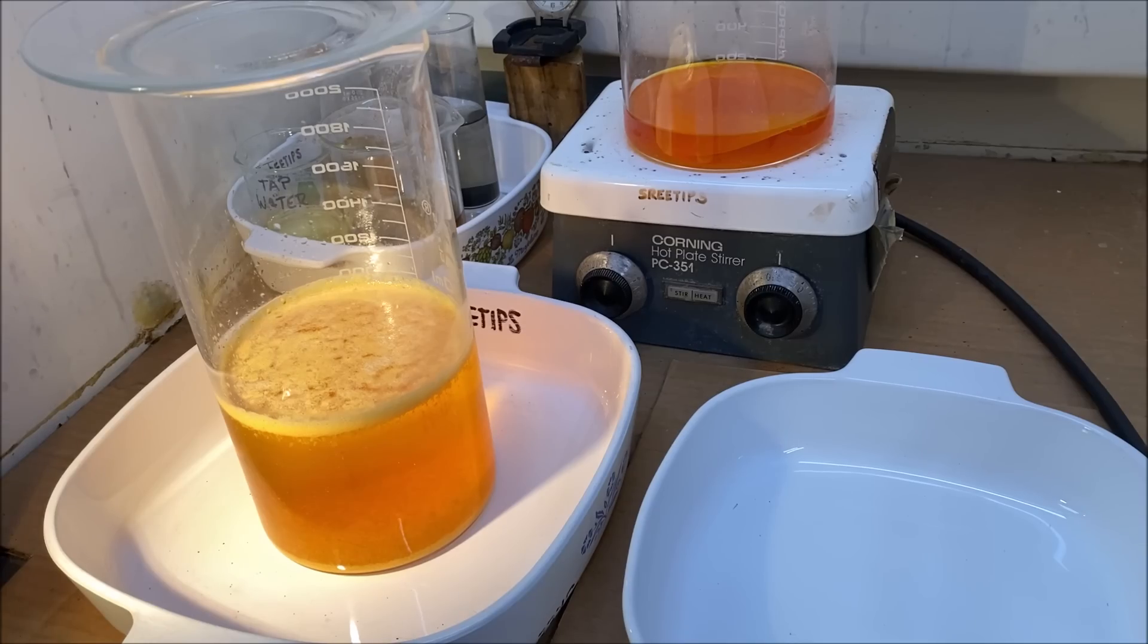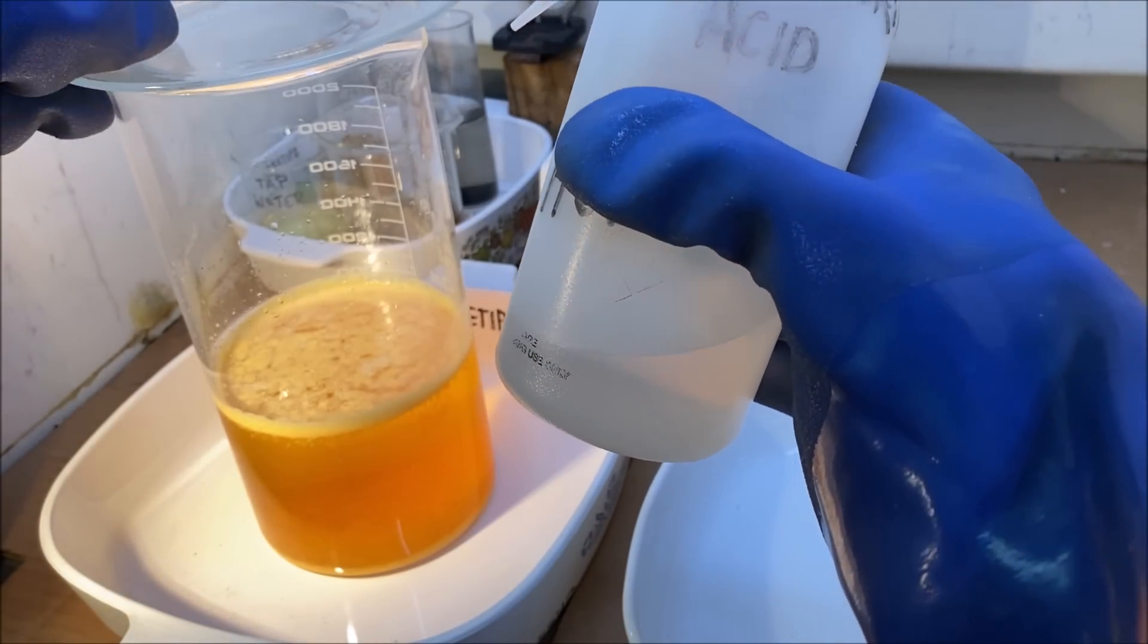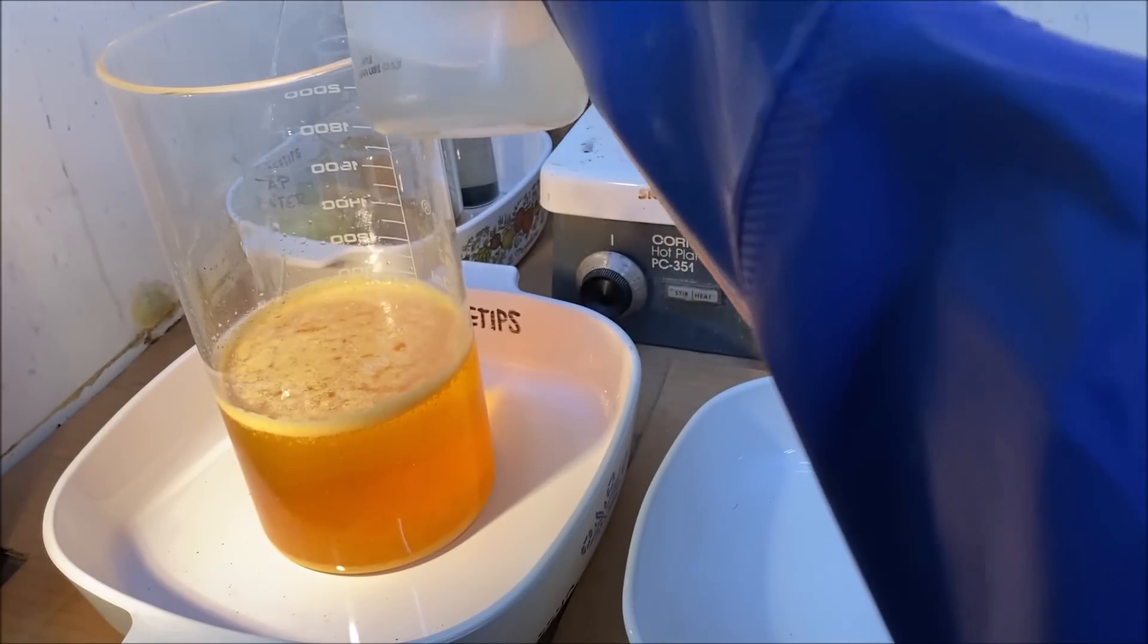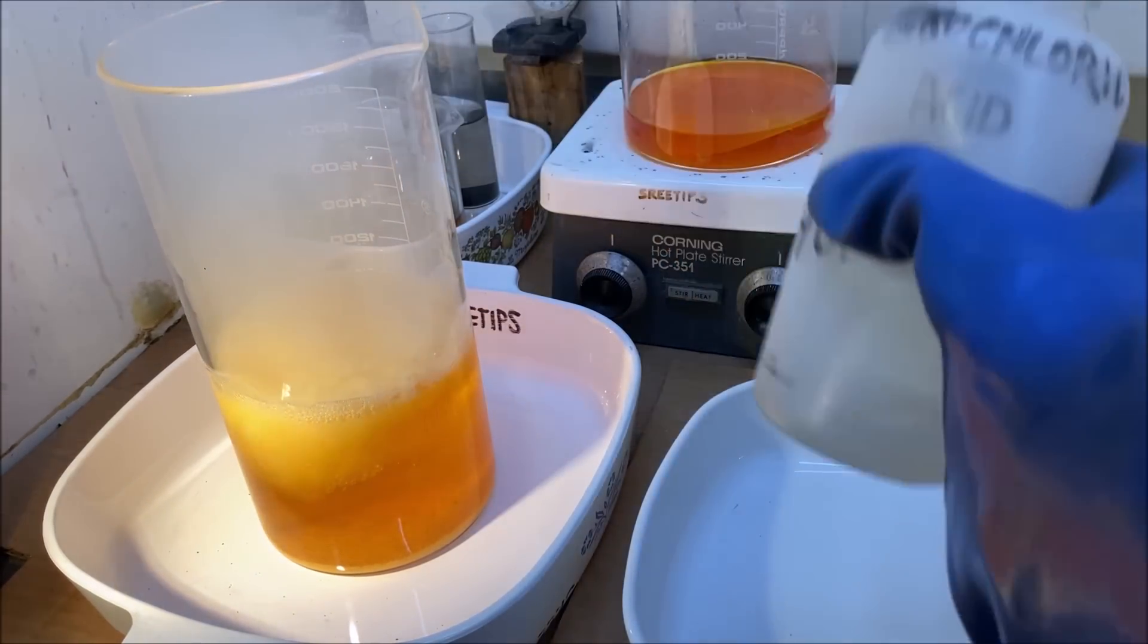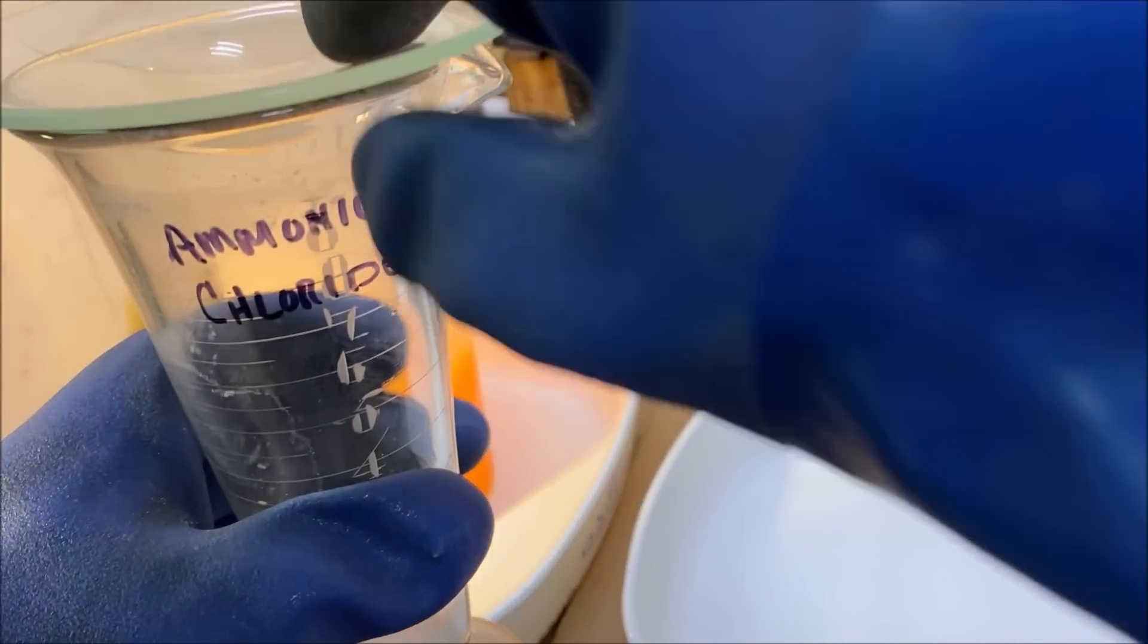Welcome back to part 6 of the Platinum Jewelry Refining Series. I'm going to start by adding a little bit of hydrochloric acid to this. I'm going to add a little bit more ammonium chloride.